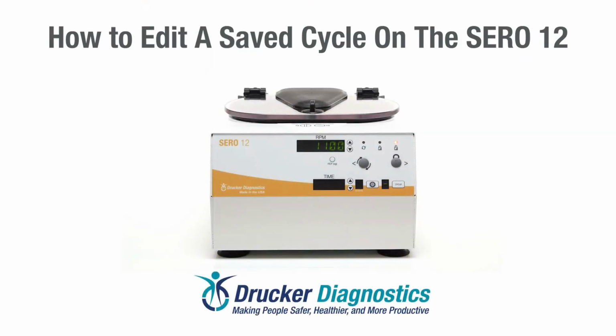This is great for any kind of preset that you might want to reuse, a cycle that you run frequently, just anything that you're going to use over and over again. But if you ever want to change those already saved settings, you don't have to create a new saved cycle. You can edit one that already exists. And that's exactly what we're going to see how to do in today's video. How to edit a saved cycle on the SERO 12.